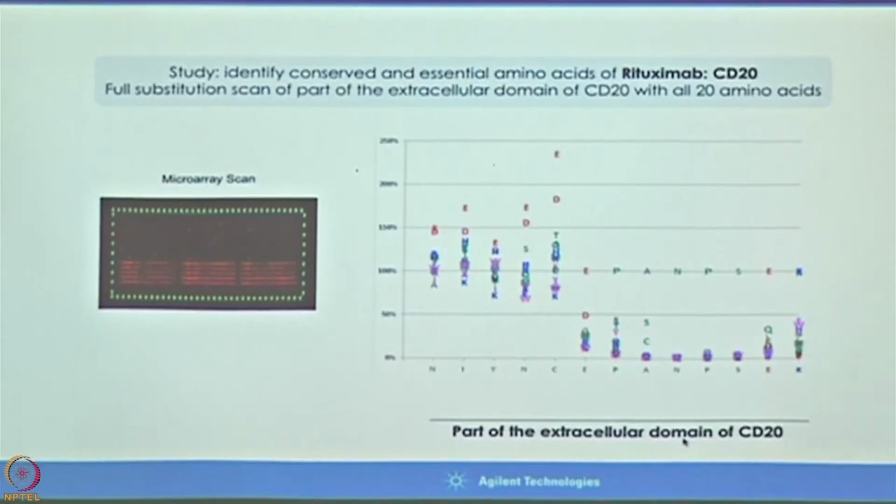So these are the epitopes where they are not getting any signal because of the replacement of that amino acid, right? So these are the clear epitopes, where they do not get any signal by the replacement. So these are the three different ways the peptide is used for the conformation, meaning for the epitope study. For any antibody synthesis, you need to check for the epitope study. You can easily do it with the protein peptide array.